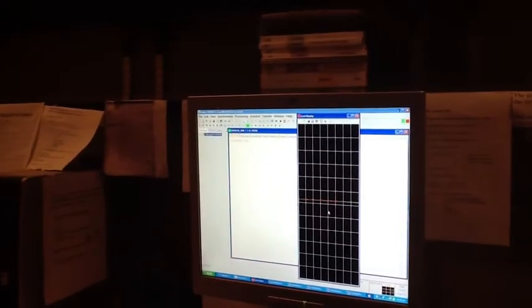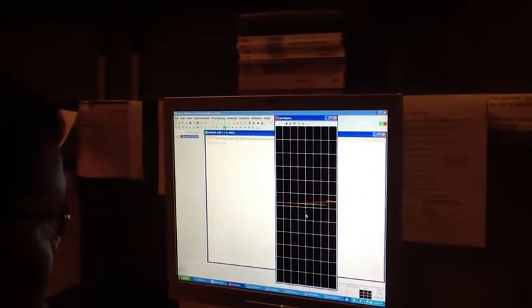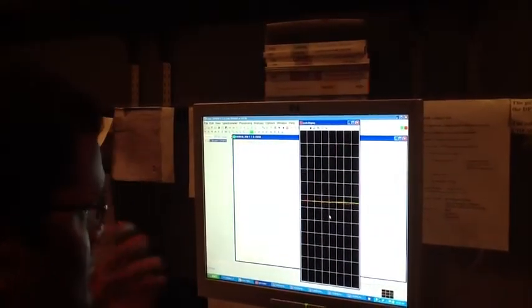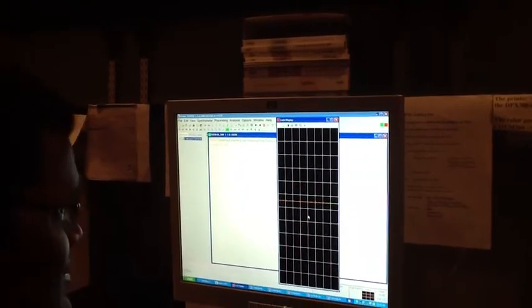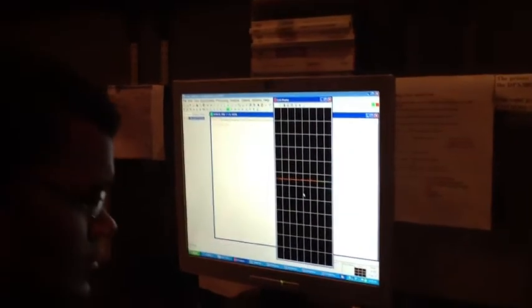Do we have to talk about how you put it in the thing? Which one? This one? In the lab report? No, no need of that. The state that we just had our sample, how your spectra is and all those you can discuss, but this one is not necessary. Noise, what is that? This one is like signal stabilizing.